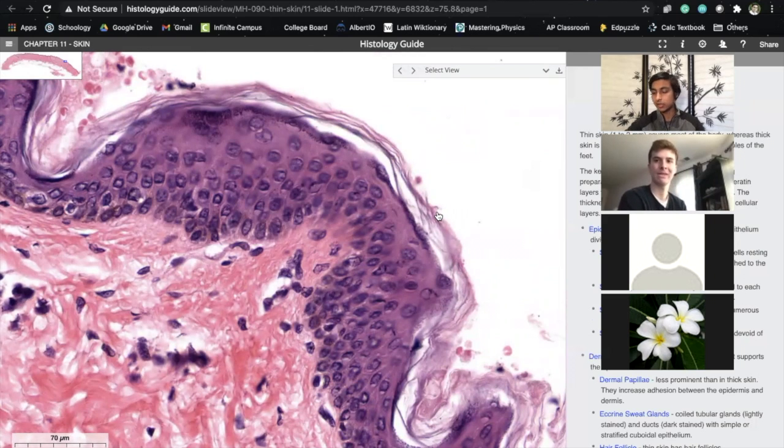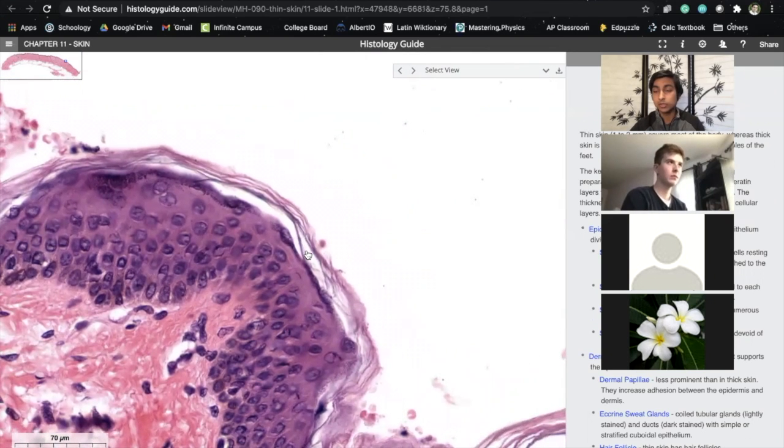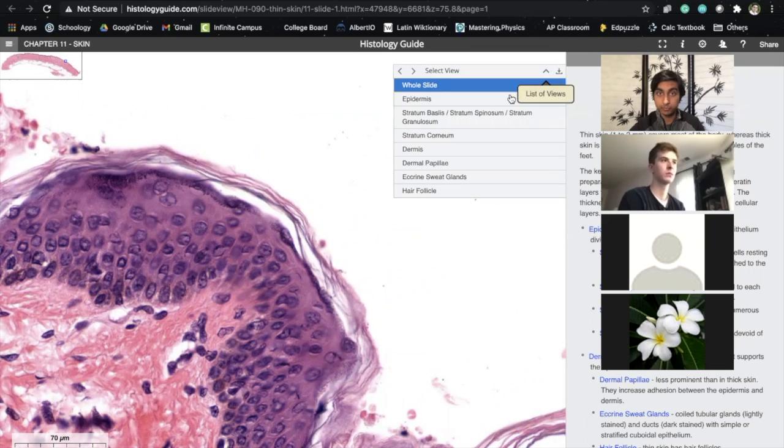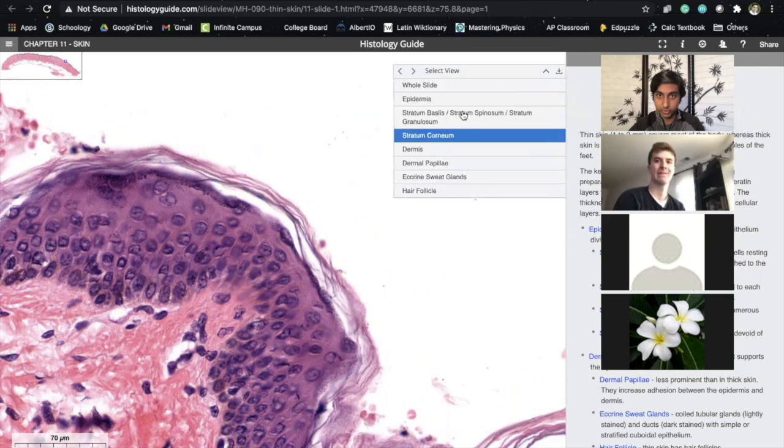Okay, and that's what you see when you look at your skin and you have dry skin that comes off, for example. That's a more vivid example. If you had dry skin, it'd probably be a little bit thicker. And so in certain diseases where you tend to produce a lot of dead skin cells, you'd have a much thicker region here. Okay. And so I want to go down and I'll give you the right terms here.